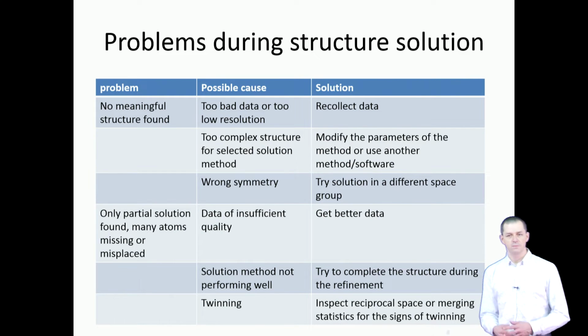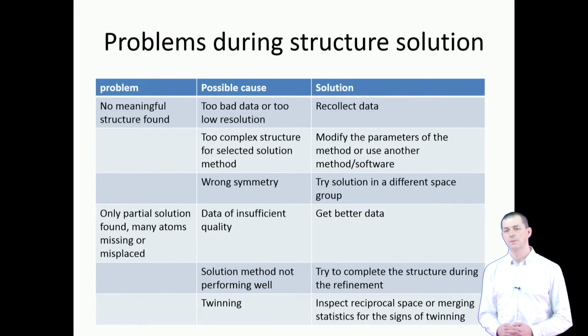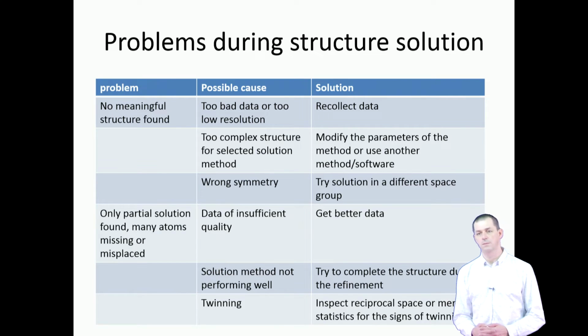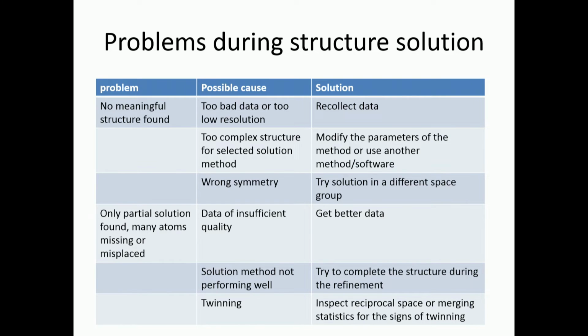Any other question? Yes. Sir, how to deal with sensitive systems? The problem is, whenever I am taking the crystal out of the solution, it degrades, the quality decreases. So how to deal with that?